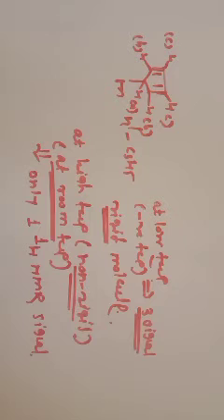3 sets of protons, so we get 3 signals. But at high temperature the molecule shows fluxional behavior, so there is an exchange of these protons. There is a 1-2 exchange or 1-3 exchange, and the exchange is so rapid that the NMR instrument cannot detect it, and therefore at high temperature, when the molecule is non-rigid, that is at room temperature, we get only one H1 NMR signal.